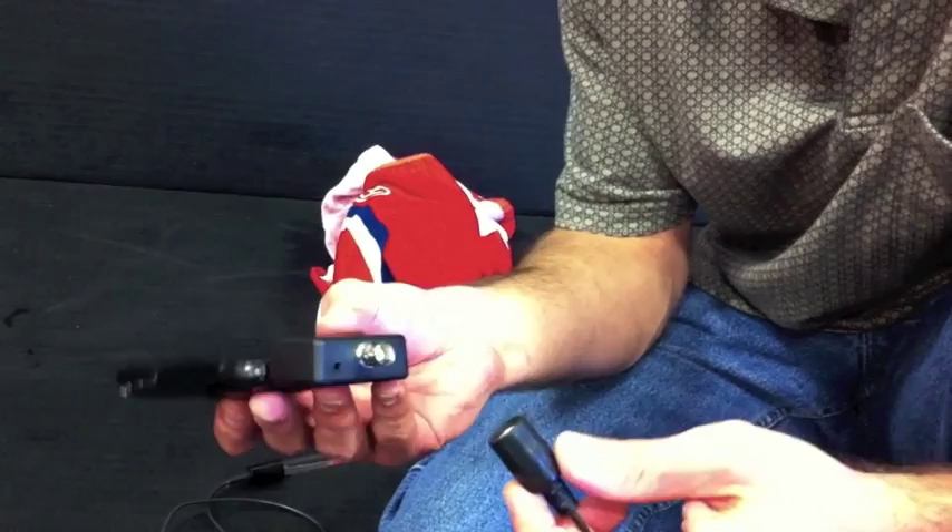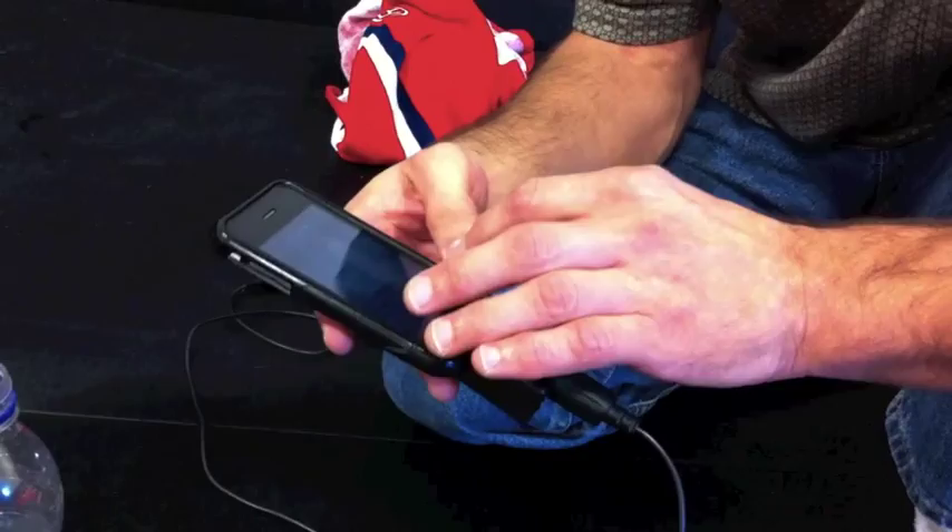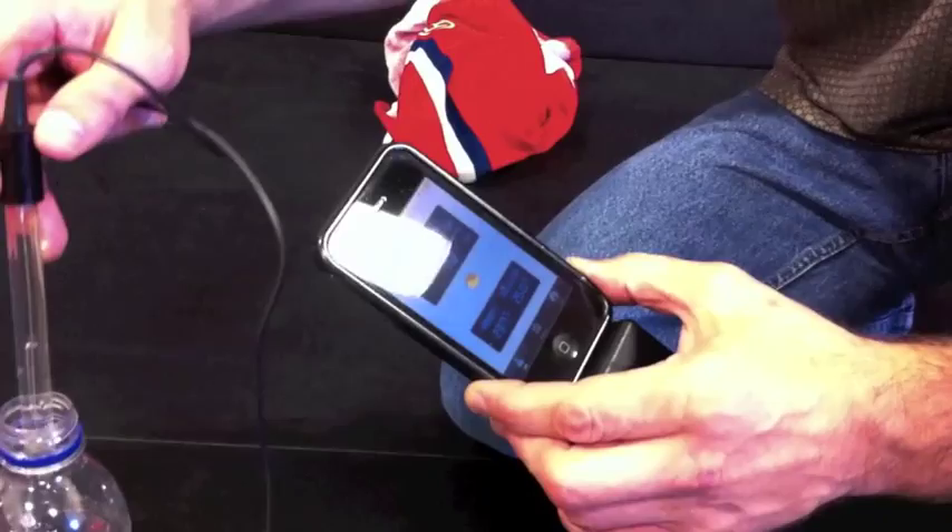Once it's connected, you can turn it on and fire up the PH meter app. That's an app you can get in the App Store? That's right — it's available for free on the App Store. We put the electrode in some water and it will give us a reading of the PH.